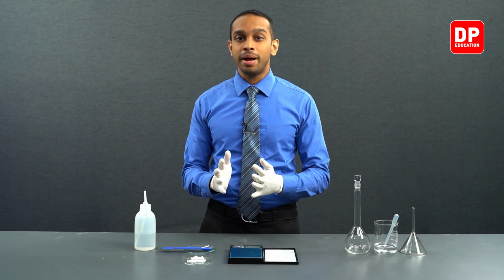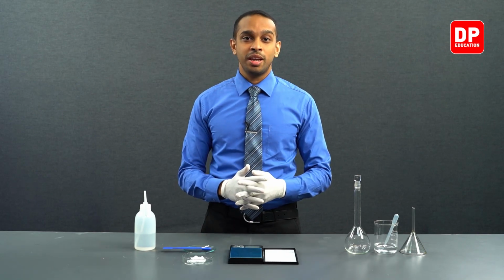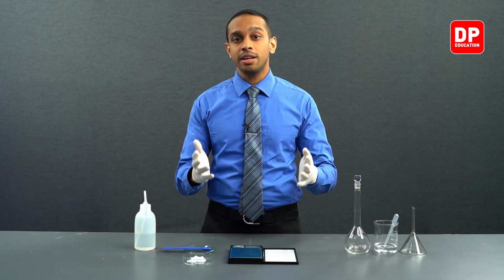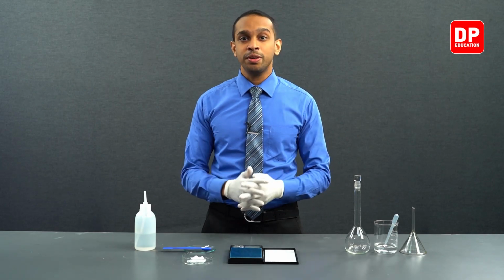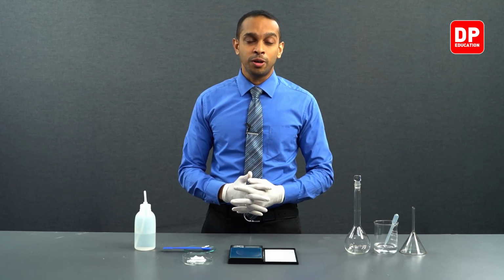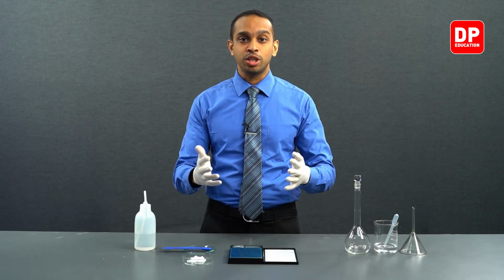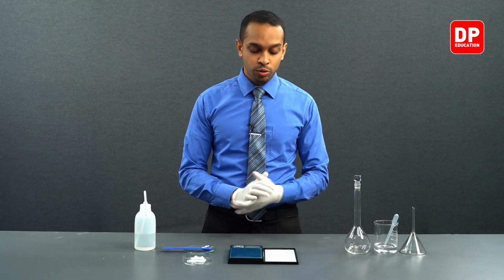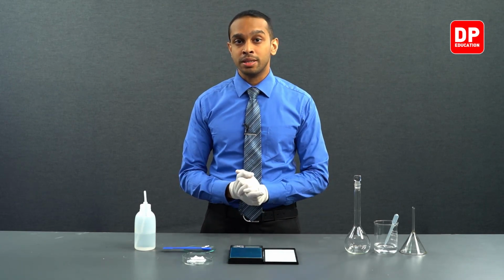However, potassium permanganate is a desirable titrant because it will give you a color change. It acts as a self-indicator, so it will give you a nice color change at the end of the titration, and we prefer to use potassium permanganate. If it is standardized, we can use it for titrations to determine the endpoint without having to add an additional indicator. With that knowledge, let's move on to measuring the mass of potassium oxalate needed for this practical.